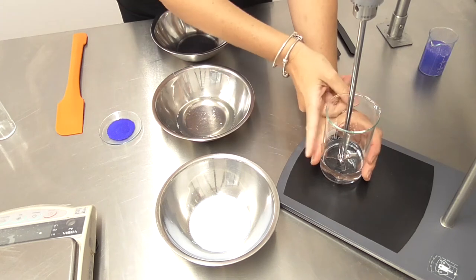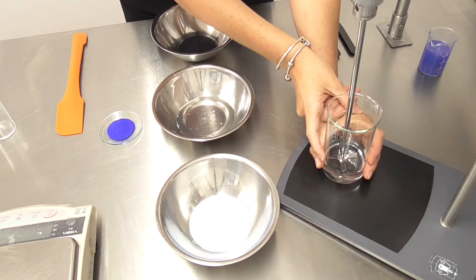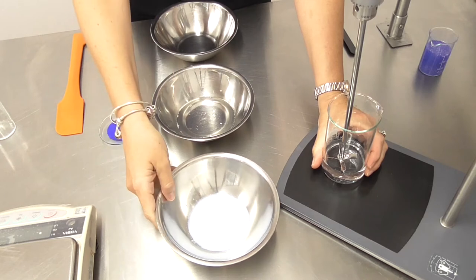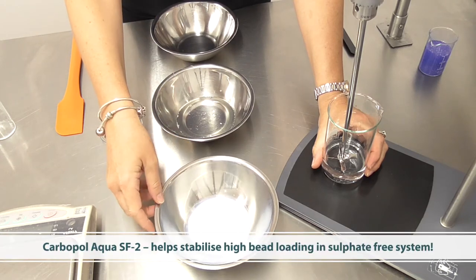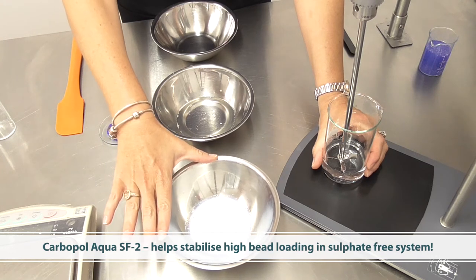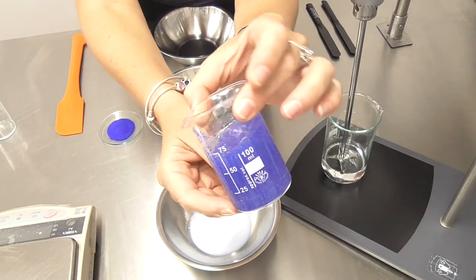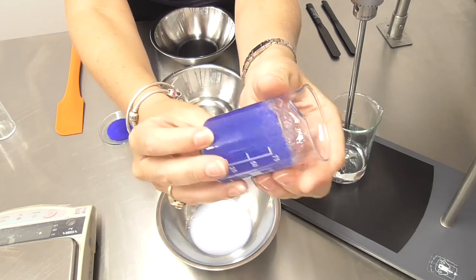First things first, we've got our water measured out here. Now normally I would mix my surfactants and my water together and then add my thickening agent, but in this case I'm using a very special material. There are a couple of grades of this material but I'm using this one for its stabilizing ability: Carbopol Aqua SF2. This is what's going to help me create this beautifully stable system even with a very high input of beads.